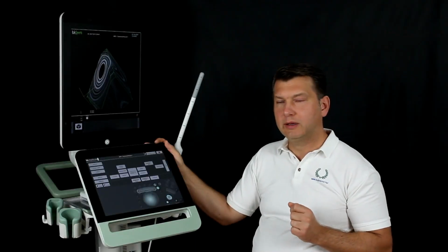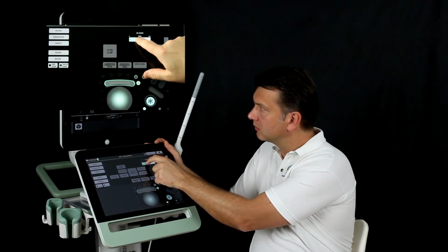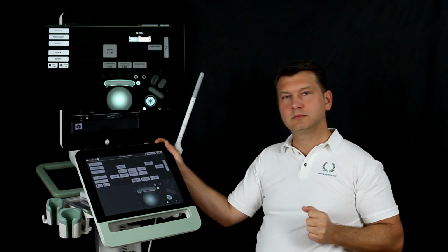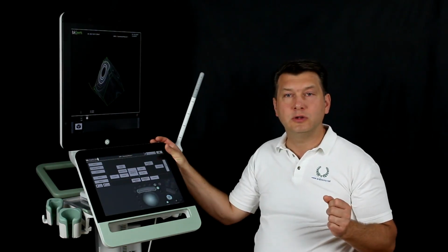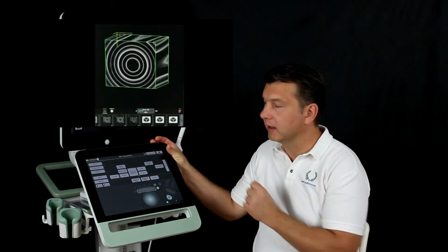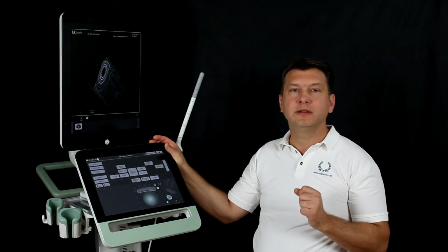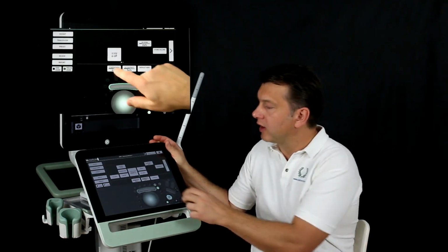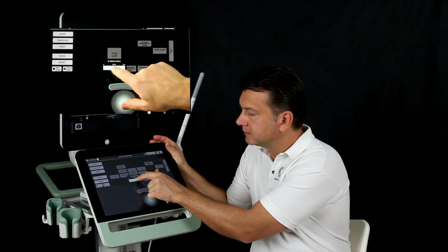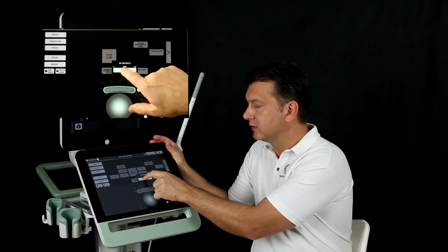To zoom in, we click on this button. Zooming should not be done too quickly, as each individual surface must be recalculated by the scanner again. After the box is created, brightness and contrast can be adjusted. Brightness, just here, and contrast, adjacent to it.